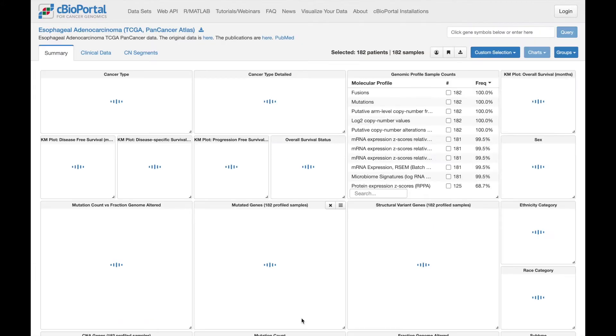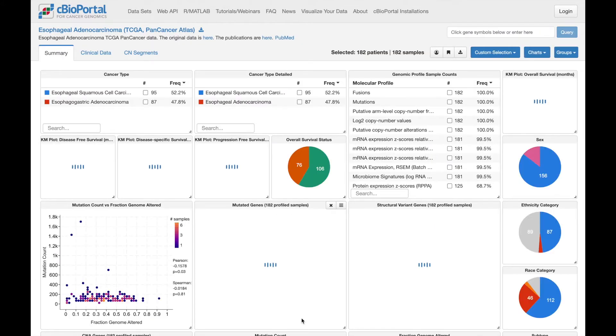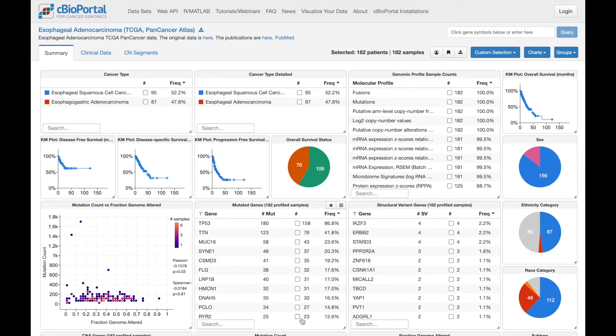Clicking this button brings us to study view, where we see a number of different charts which summarize the different data available for this study. Let's take a look at a few of these different charts.